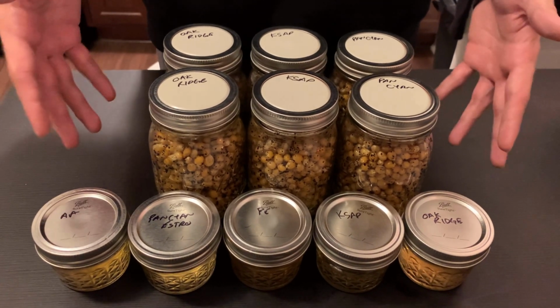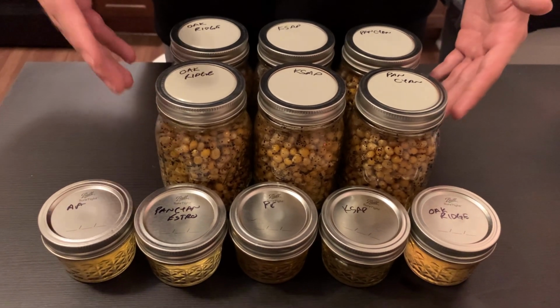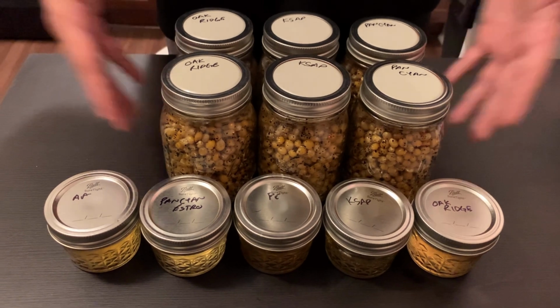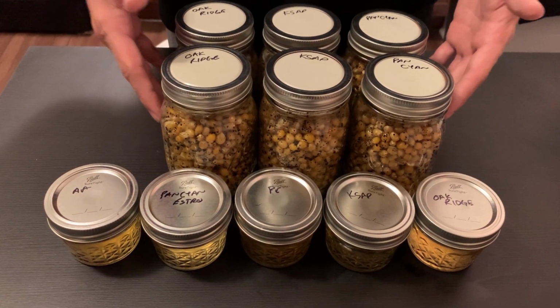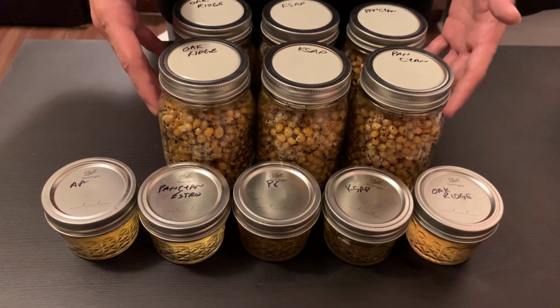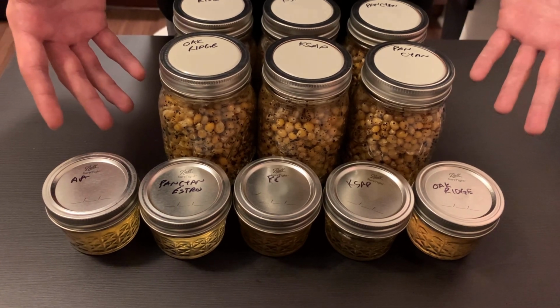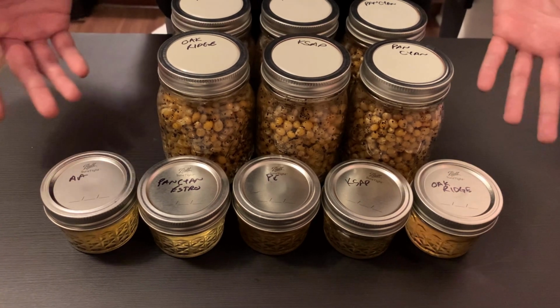Once again, this is just simple home mycology. Don't stress it way too much. Don't stress the sterility of everything. There's gonna be people out there telling you, you have to wear gloves, you have to wipe every single thing down, all the jars down, this and that. But you guys saw the extent of what I did, and I don't get contamination at all, hardly.